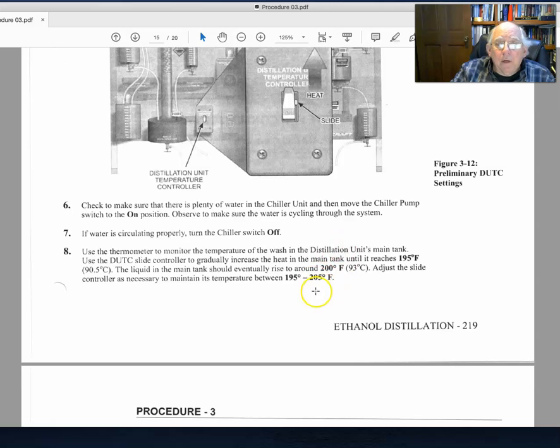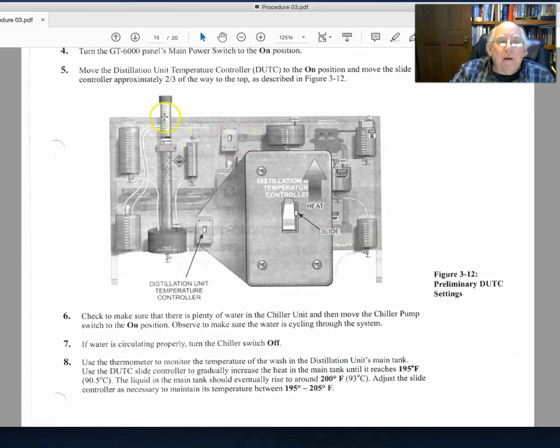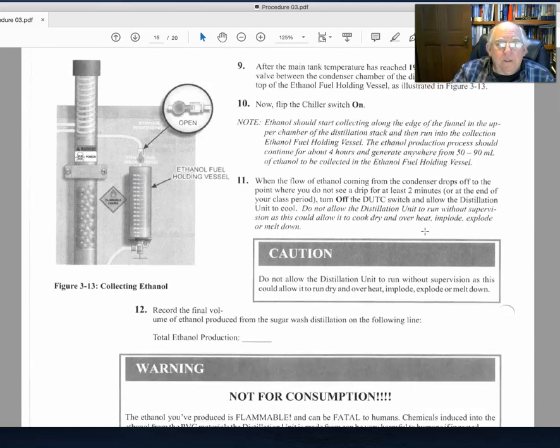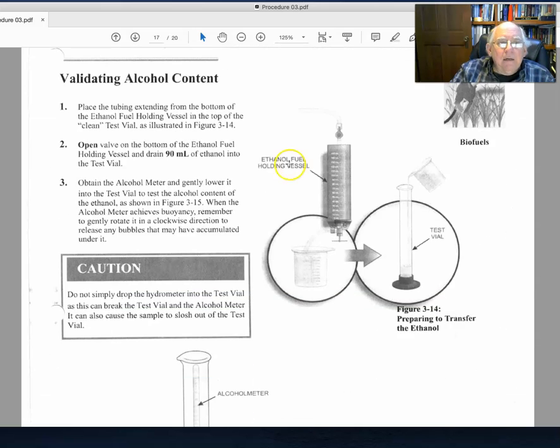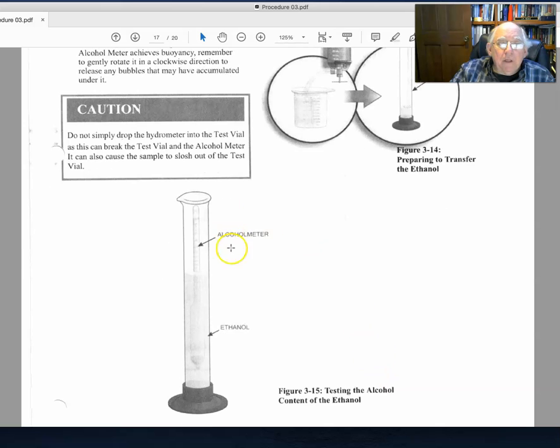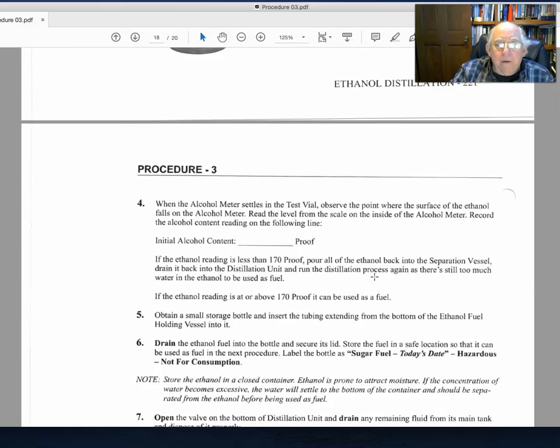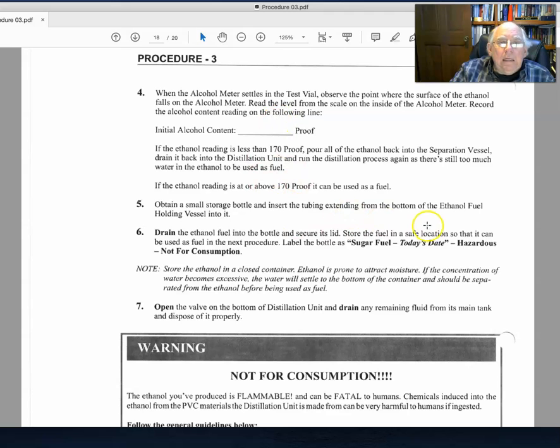And then going through the distillation process in a similar fashion, maintaining the temperature of the boiler not to exceed 205, and waiting for enough time for the vapors to condense into the holding vessel. Then taking out the ethanol fuel and obtaining the alcohol content once again by the use of the alcohol meter, and reporting the alcohol level in a proof which is just two times the percentage by volume.